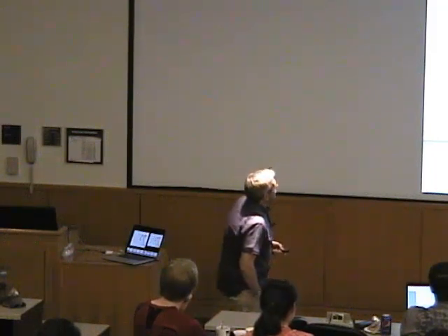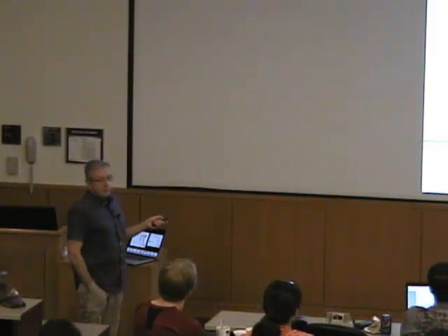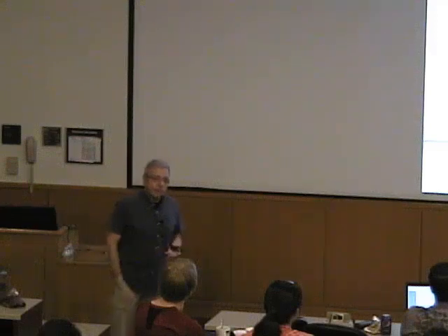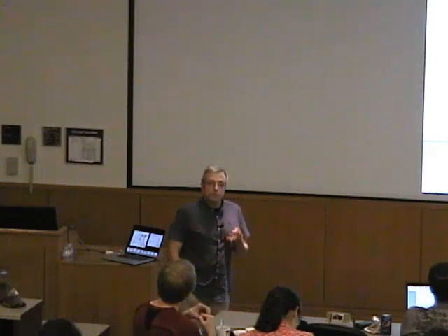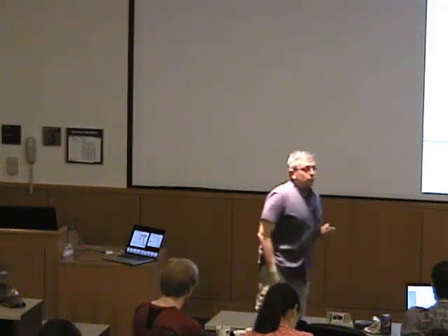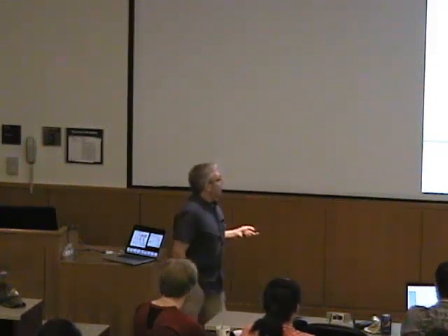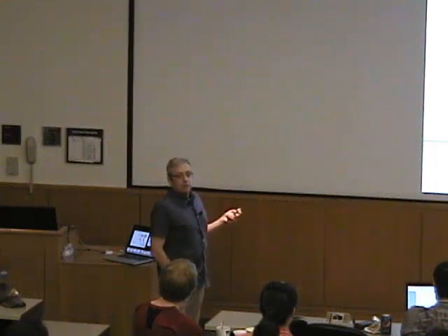And the other point, of course, is that in X-ray crystallography you are far from being stuck at 2 angstroms. So when it comes to molecular questions, ideally, you want to get to resolutions that really show you positions of individual atoms. That's one thing, and it's going to be a way to go for electron microscopy to get there. And it's also that if X-ray crystallography actually works out, as you see in the practicals, where it takes us about an hour to solve a structure completely from scratch, it's a pretty well-established and fast method. So I guess the days are not quite over.